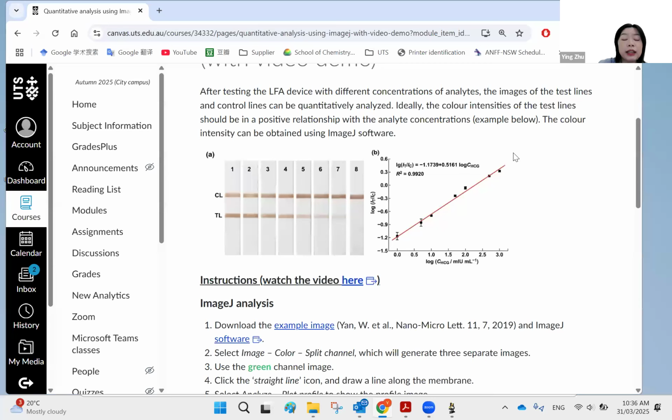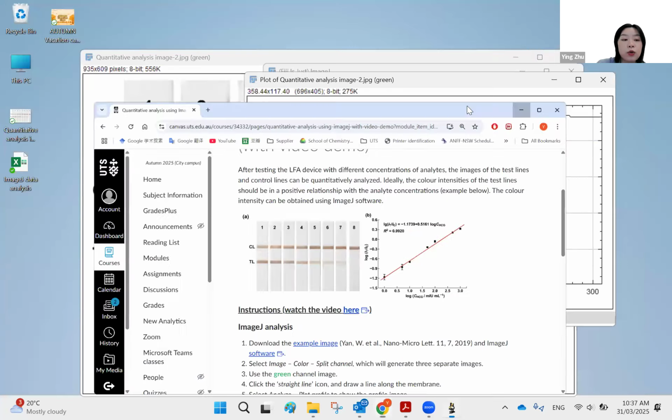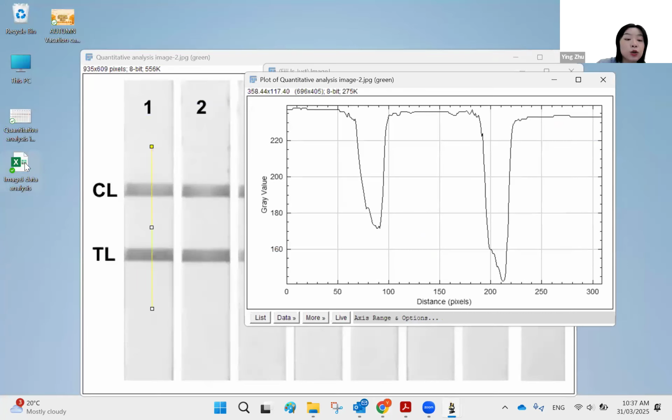Next week, when Anthony gives the second MATLAB tutorial, he will include this part as well. So at that time, you will have your data, and then we will see how you plot this linear relationship, and also how you get this relationship and R value by using MATLAB. I think that is a better way for scientific presentation, scientific plotting. MATLAB is the better way. But here I will also quickly show how you can do that using an Excel file, okay?